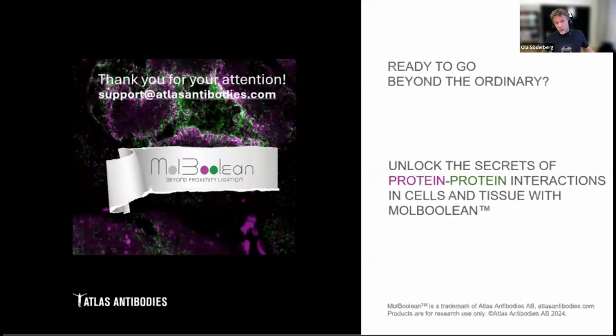We have never tried, but I would assume that it would be possible. If the FISH probes are specific and bind well, you have to adjust the protocol so that it works for the FISH probes, and after that, I think it would be perfectly fine to use the MolBoolean as well.